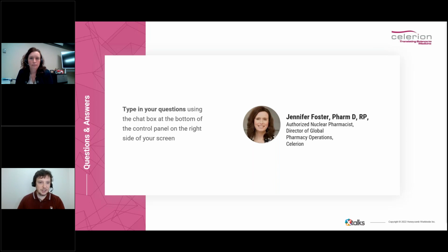Very good, excellent. Thank you so much. The next question we have was wondering if you can comment on if there's any USP guidelines for ophthalmic products, or do they just need to use one for IV? Yeah, so ophthalmic products are listed in USP 797, so we would follow the same kind of formulation procedures that are listed in there. So it would require some sort of sterilization. Typically what we see at Celerion is use of a 0.2 micron filter for a final sterilized product. So, the same kind of beyond use dates, that kind of thing. We wouldn't probably have a preservative used here at Celerion. It would probably be a compounding, a sterilization, and an administration right away.